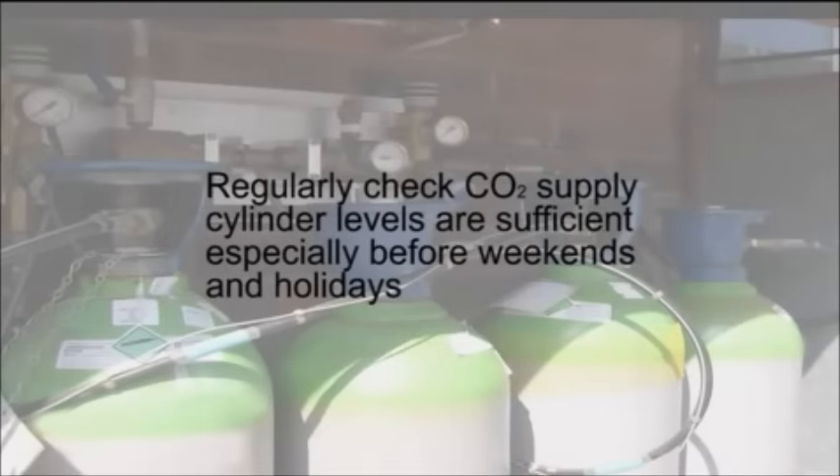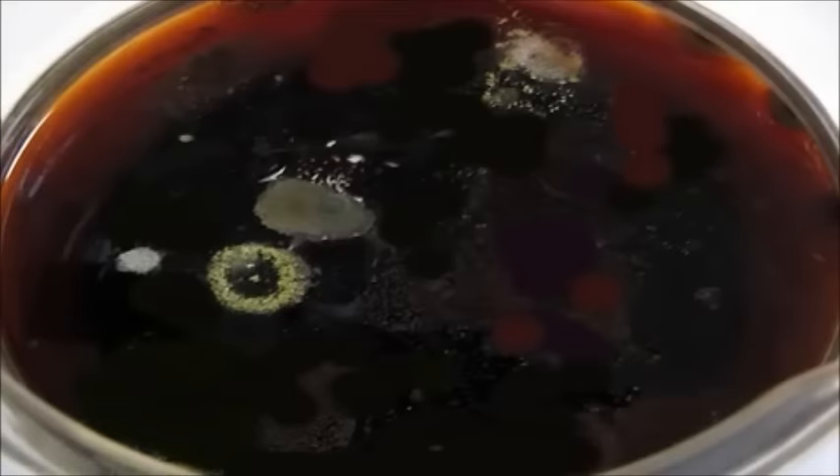Regularly check CO2 supply cylinder levels are sufficient, especially before weekends and holidays. Incubators are ideal breeding grounds for bacteria and moulds, which could contaminate your cultures. Minimize this risk with regular monitoring and cleaning.